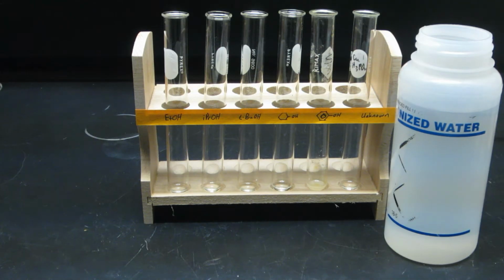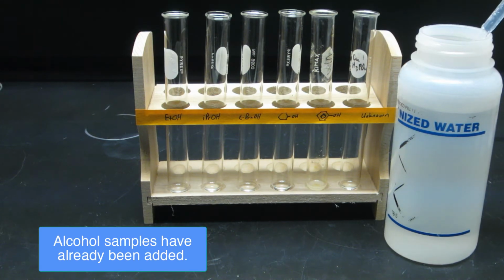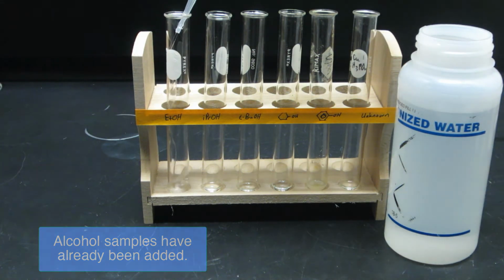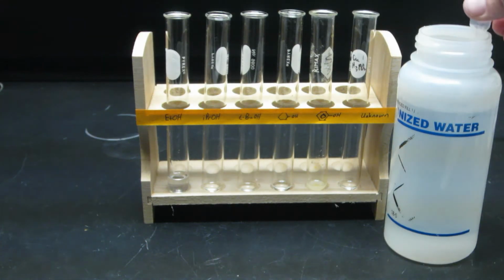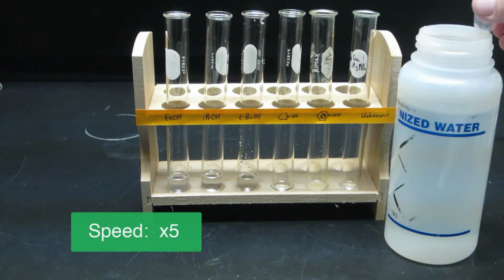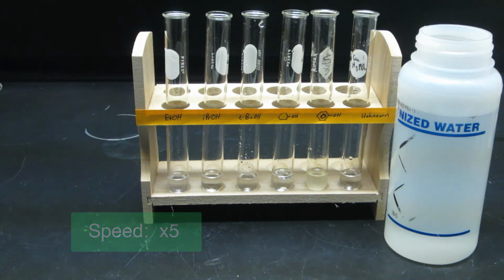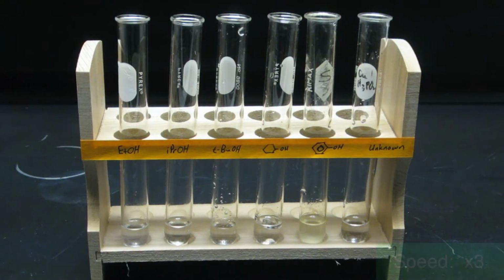And the test tubes there, labeling from left to right. First one's ethanol. The second one is 2-propanol. Third one is 2-methyl-2-propanol. Fourth one, cyclohexanol. The fifth one, phenol. And the last one is the unknown.